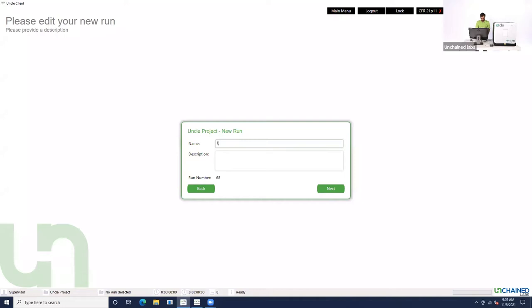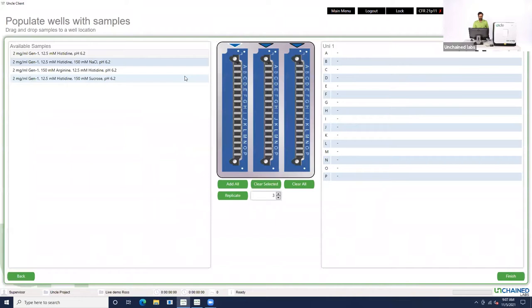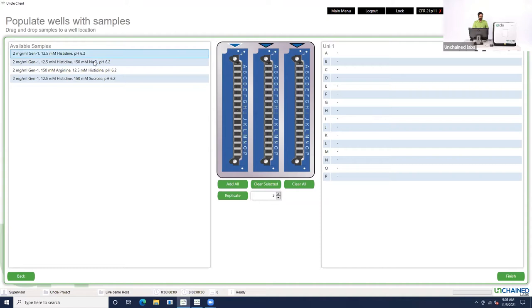Click on the project folder. We're going to save everything and give this run a name — we'll call it LiveDemo. Now we pick which sample set we're going to use. We're looking at a monoclonal antibody in four different buffers: 2 milligrams per milliliter of our monoclonal antibody in 12.5 millimolar histidine buffer at pH 6.2. The only difference between these four samples is the excipient: no excipient, 150 millimolar sodium chloride, 150 millimolar arginine, and 150 millimolar sucrose. We highlight all four samples and hit replicate — that adds samples to the virtual UNI in the middle of the screen, with triplicates listed on the right.